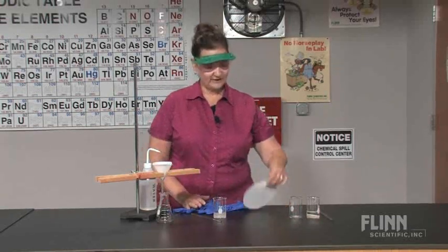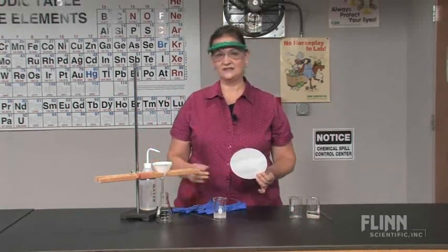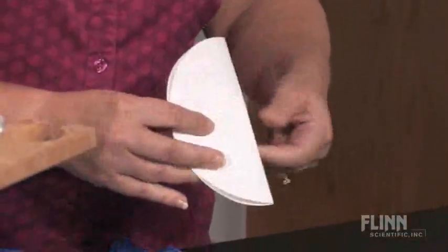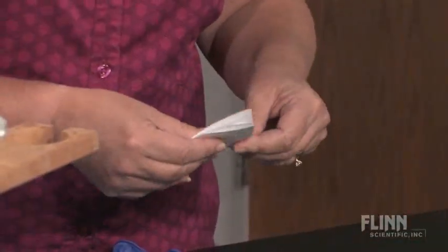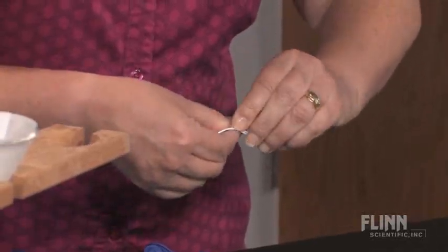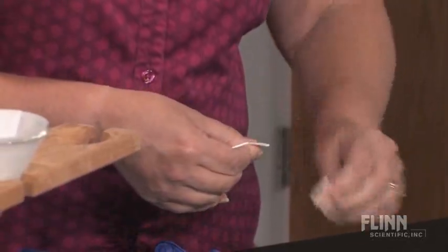First, you want to make sure that your filter paper matches the size of the funnel. You're going to fold it in half, and then in half again. Tear off one corner. This will help the filter paper lay flat against the funnel.